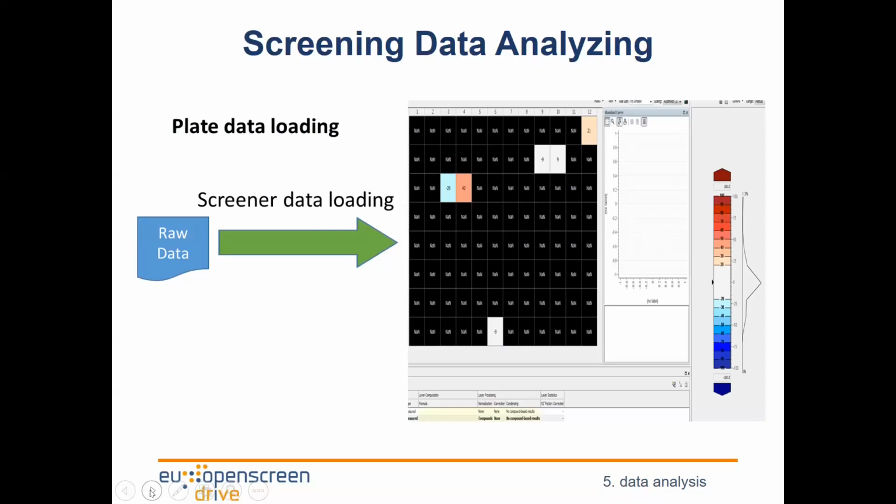Also, there are many tools to do this, and some are free, and others are different processes to do this in an automatic system. Automatic systems avoid errors and avoid having results that at the end are not good ones, where the only thing you do is lose time and identify some hits that are maybe not the right ones. Next slide, please.